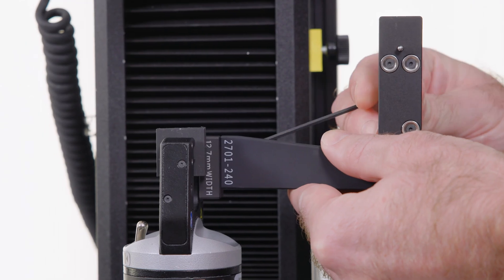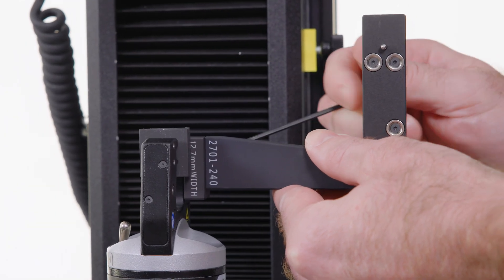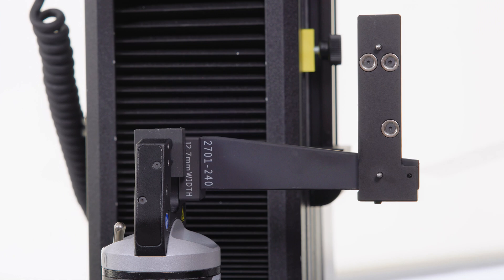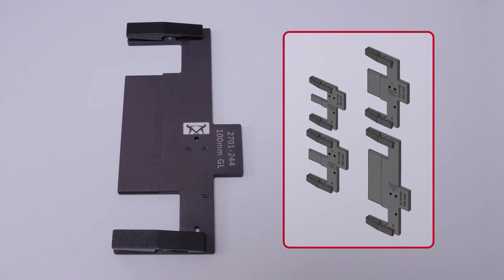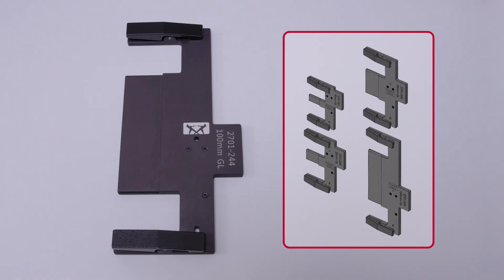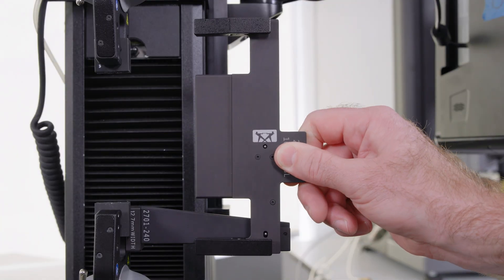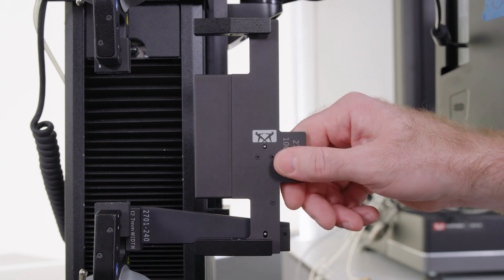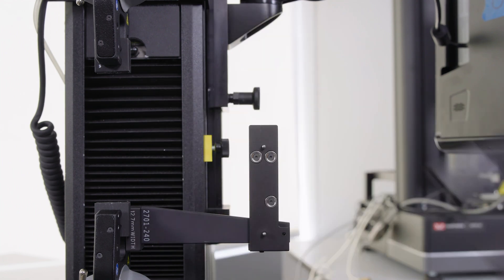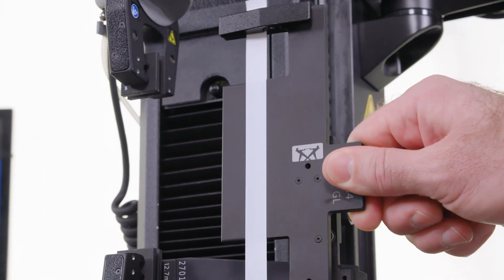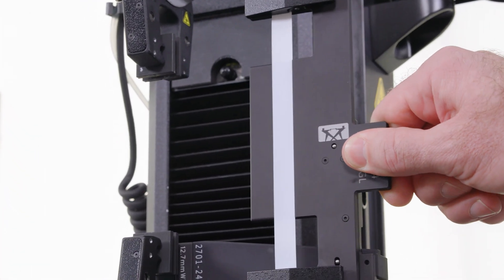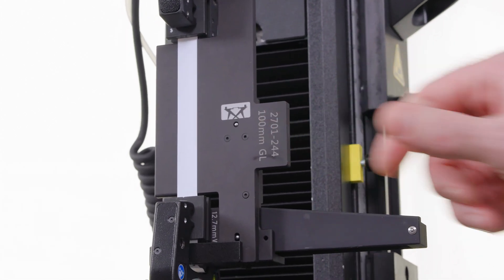The linear rail attaches to the width block and provides the fixed travel for our last component, the alignment clip, which is also available in multiple sizes to accommodate the most common gauge lengths. This attaches to the linear rail via magnets and pins that make it quick and easy to snap on and detach. Everything is precision machined so that your specimens are loaded the same way every time, minimizing variation.